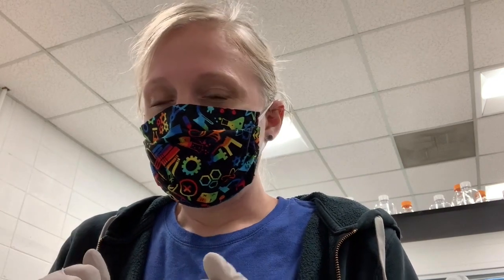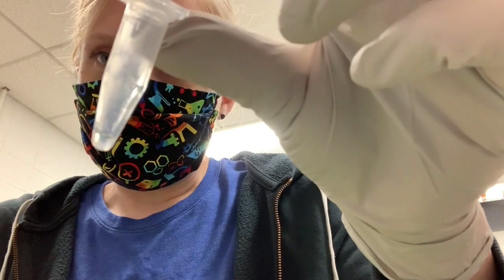I'm going to take my tubes to the centrifuge, just spin down just for 5 or 10 seconds is fine, and then I'll bring them back for the final part of the spinning process. In the centrifuge I was using, you can use the button that says short if you wanted to just do a pulse spin. Now what I'm going to do is remove the rest of the liquid, which is now at the bottom with the pellet.